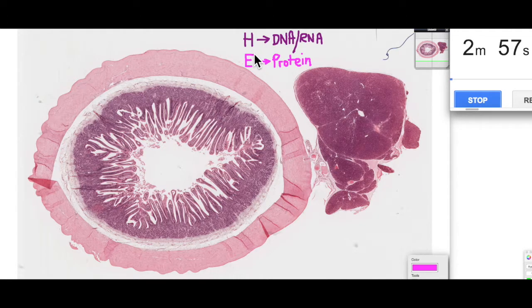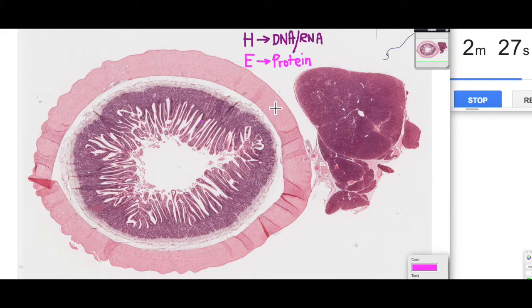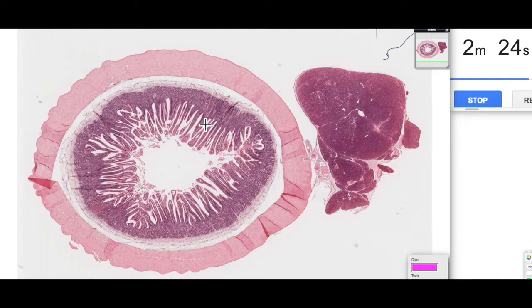H&E stains tissues at the cellular level as well as the tissue level. In broad terms, you can generally infer that this may be muscle tissue because it's full of protein, and this is likely to be largely epithelial tissue because it has lots of DNA. If we move to the cellular level we can actually see that in more detail. First I need to get rid of this and then we can zoom in.